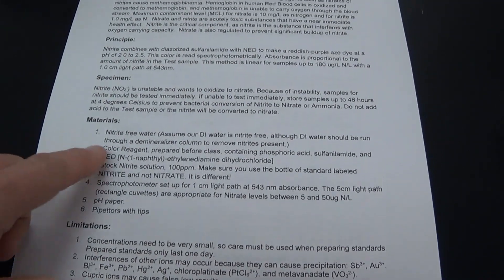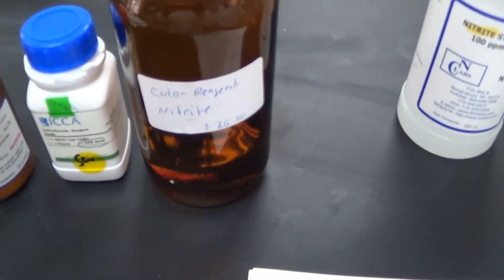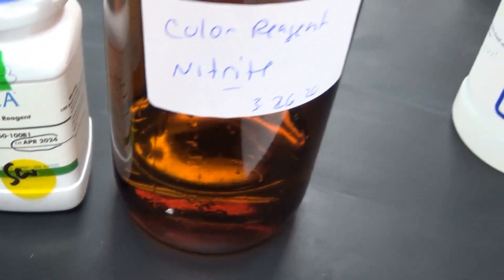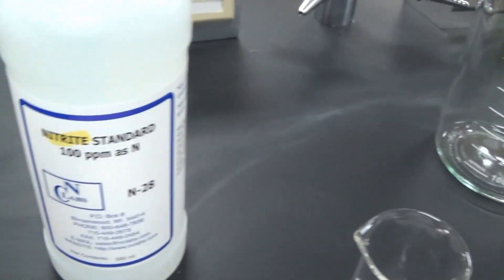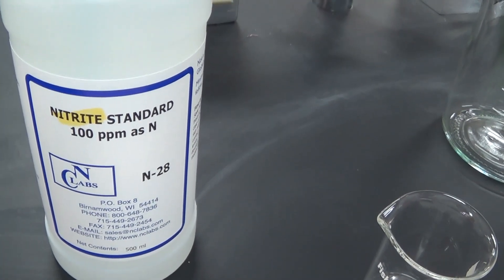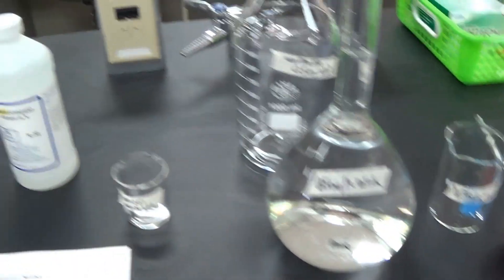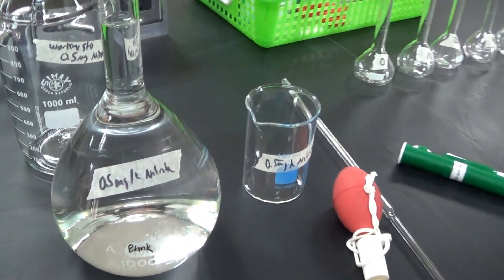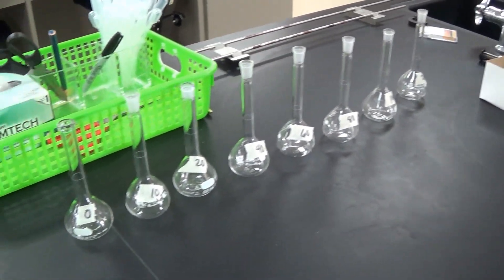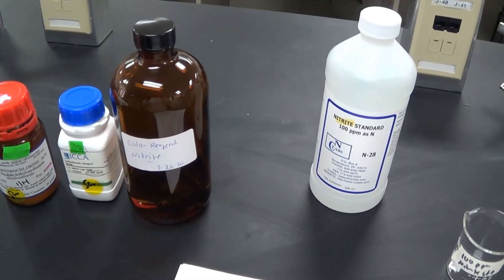What we're going to need is nitrite-free water, which is our deionized water. We need color reagent, which is made from NED, sulfanilamide, and phosphoric acid. We have a nitrite standard here that we're going to use to make our standards — note that this is a nitrite standard, not a nitrate standard. We're going to dilute our nitrite standard to make a 0.5 mg per liter nitrite standard, make several different dilutions of that working solution, then add our color reagent and read it on the spectrophotometer.